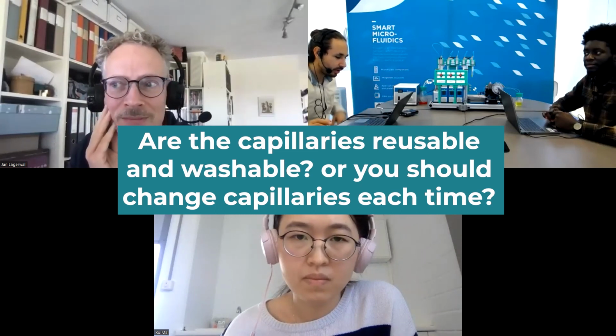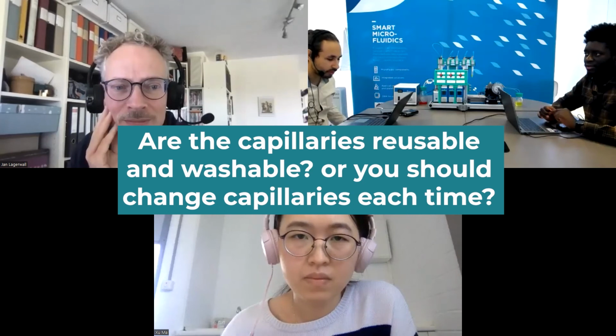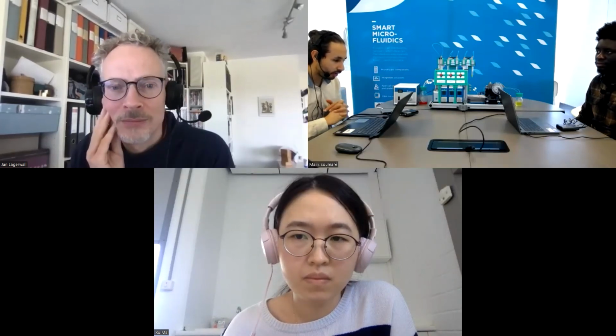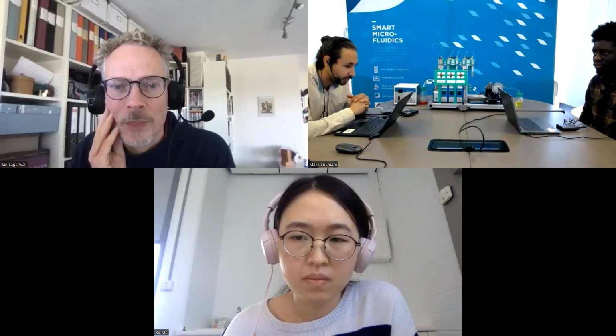It's a good question. It depends on what you want to do, on the application, but the capillaries are reusable and washable. If you want to clean them, we have different protocols that we have developed.